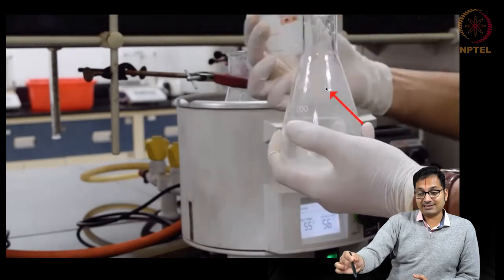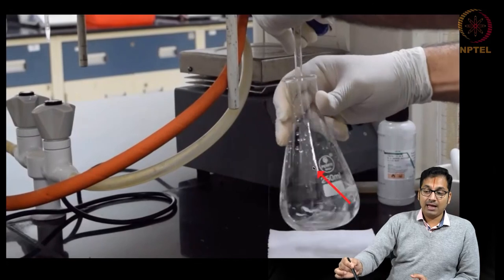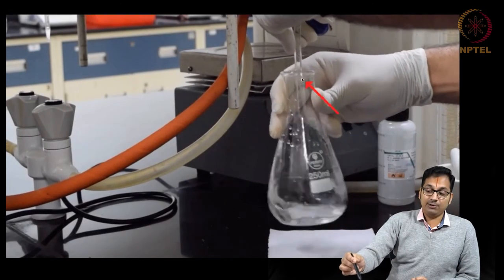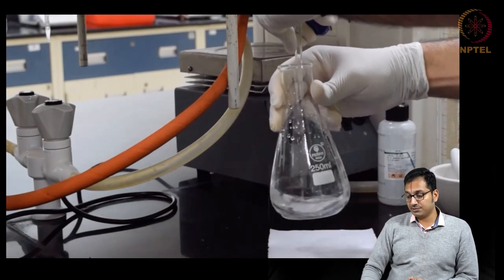And to this conical flask, add as minimum as possible of phenolphthalein, as it's a very sensitive dye, and then titrate it against the standardized NaOH solution towards the end point. And the end point is nothing but the appearance of the pale pink color.